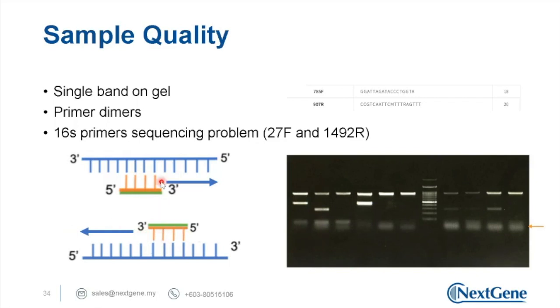The results of these two will cover the full length of the 16S. Their binding sites are not on the 27 and 1492.